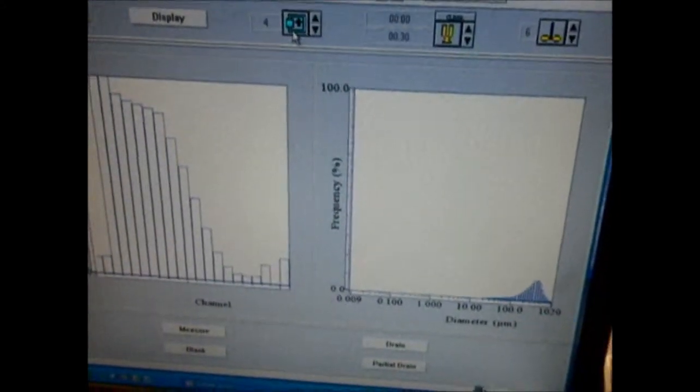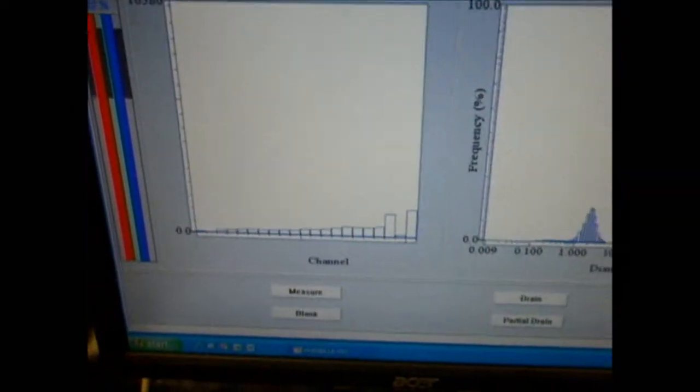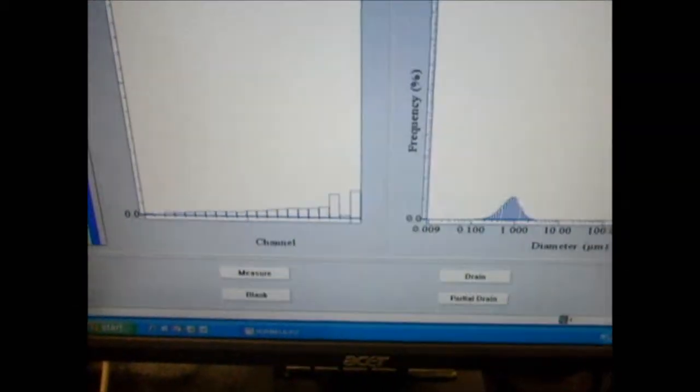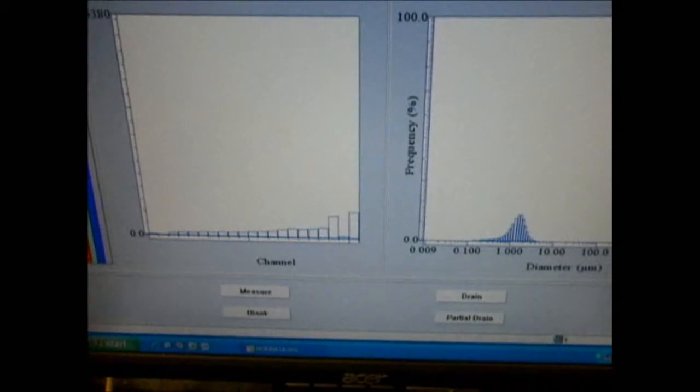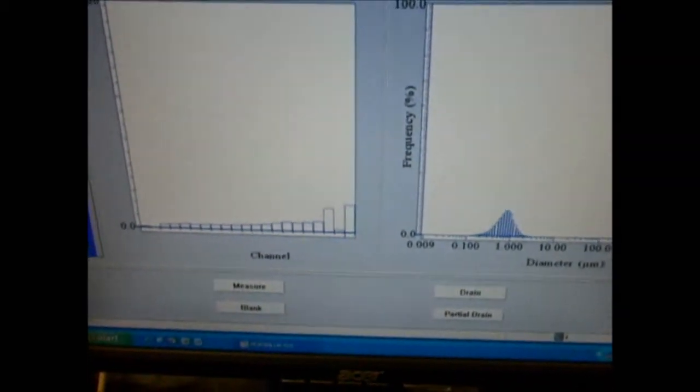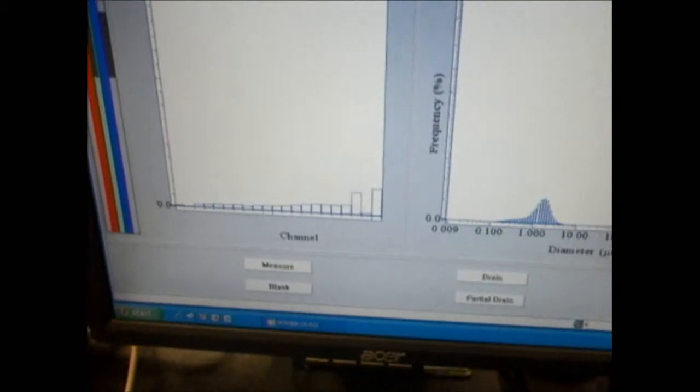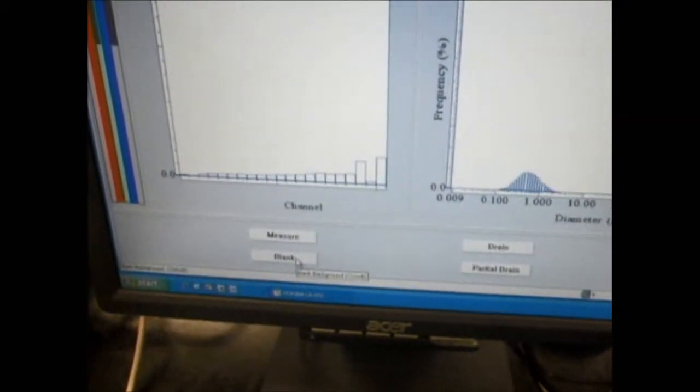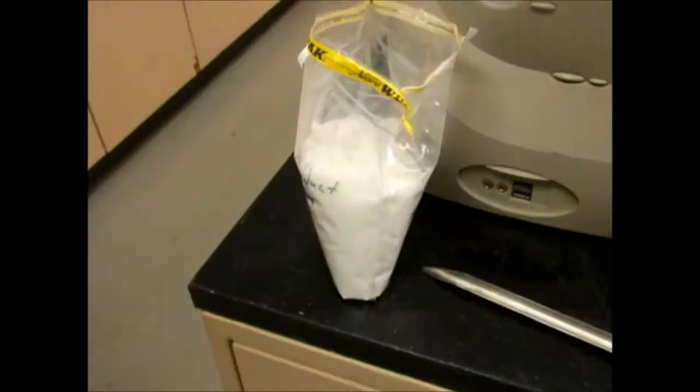You're going to hear the motor, and hopefully the baseline should come to flat — it looks pretty good right now. Before taking a blank, I first want to make sure the instrument is aligned. These are the alignment bars here. It looks like we've got four lights on, which is terrific. But if one needs to be adjusted, you need to adjust these micrometers until the lights come off.